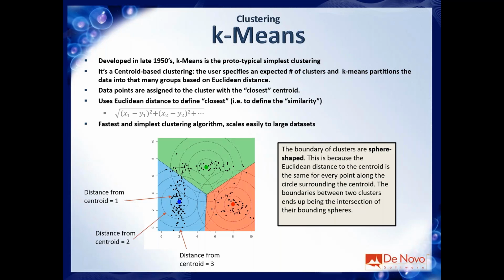Since distances in K-means basically generate spheres, this is why K-means is so good at finding spherical clusters. While it's also the reason why K-means is not so efficient in clustering non-spherical populations, which is usually the case in flow cytometry. So you rarely have a perfect sphere. Usually you have some population that's spread a little bit because you have a continuum of the expression of a given marker. But we will see how SPADE can overcome this limitation.